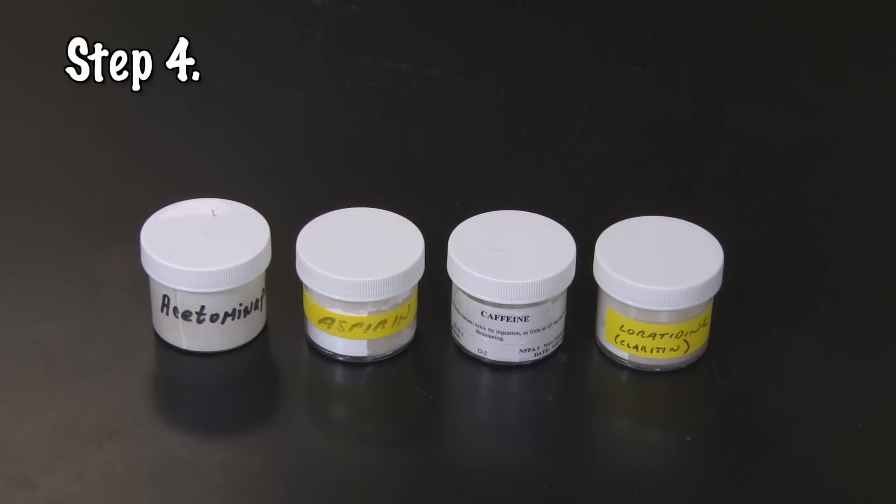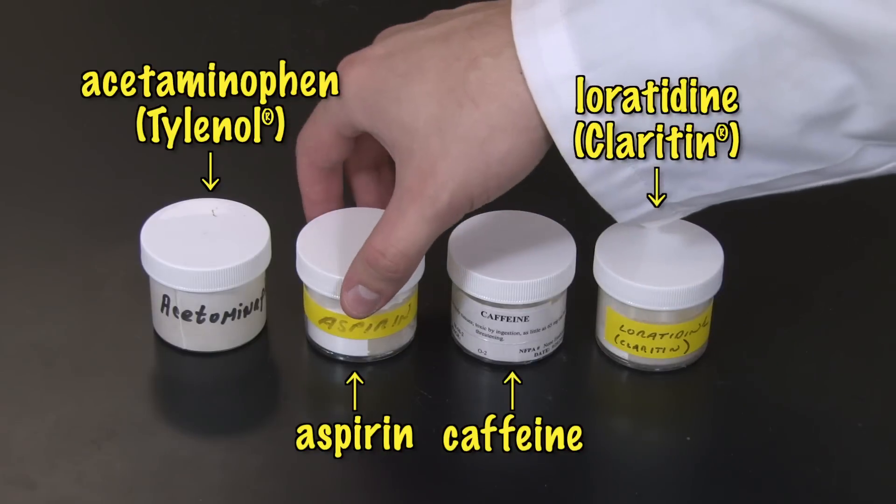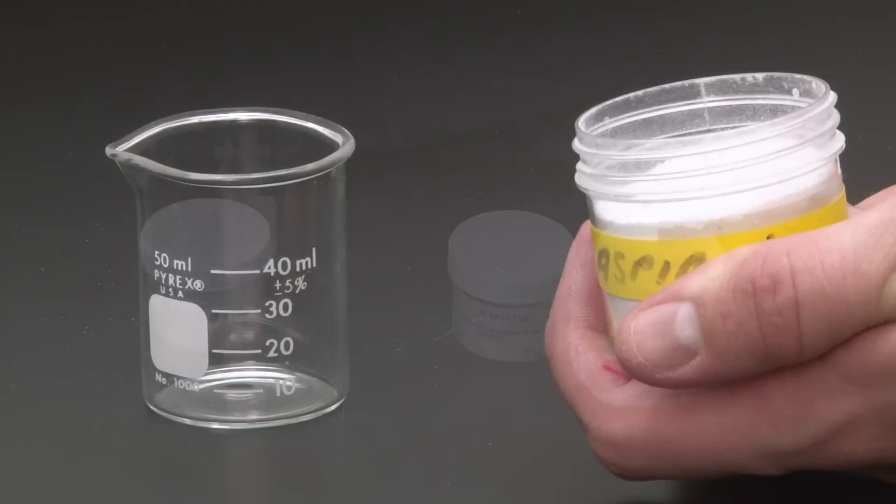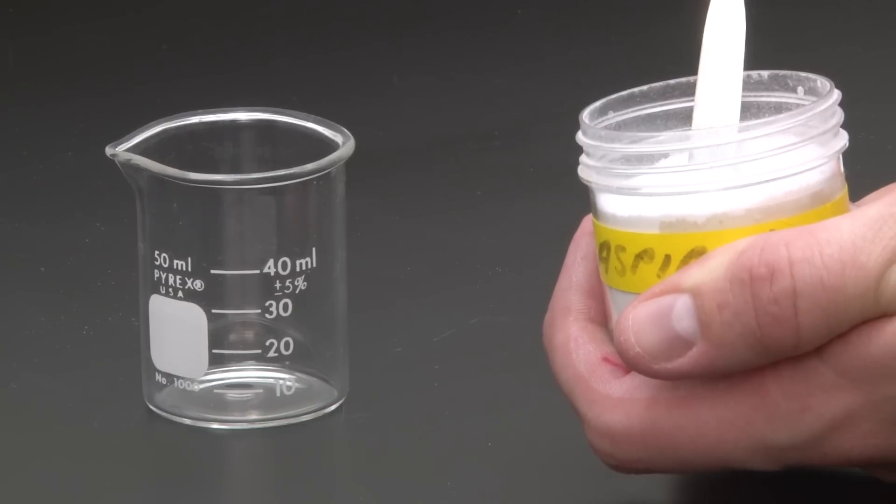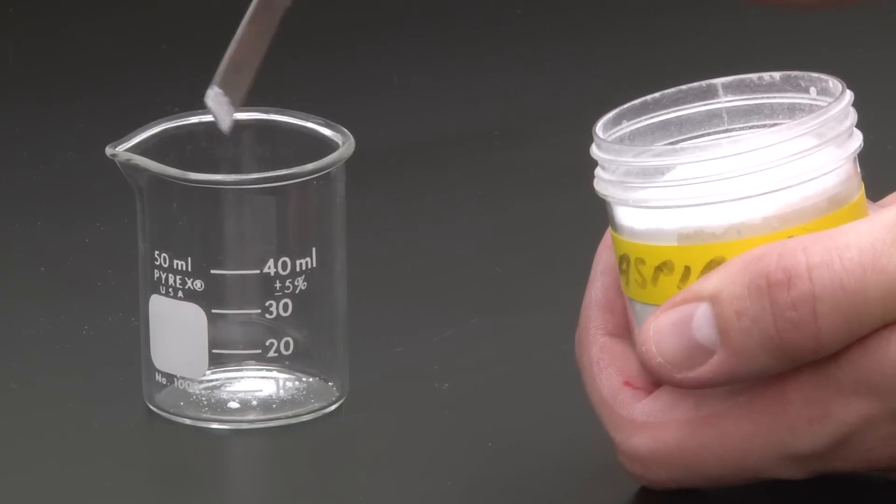Now, obtain a known drug sample. It's just an over-the-counter drug ground into a powder. There are four knowns in this experiment. Choose one of the knowns to prepare, and other groups will prepare the others. Scoop a small amount on the tip of your flat spatula and place it in a clean, dry 50-milliliter beaker.